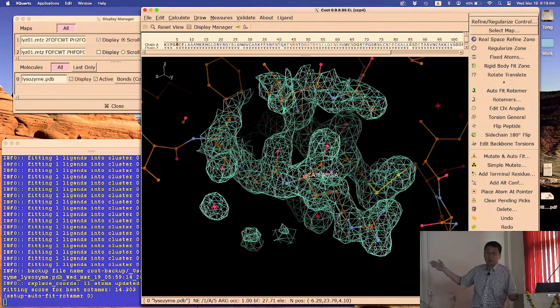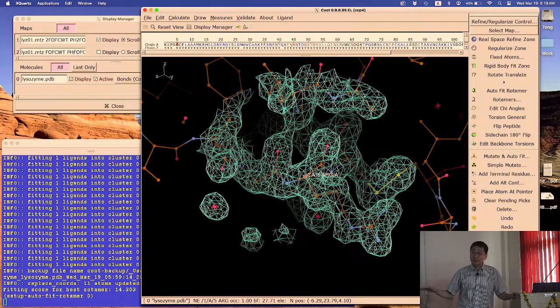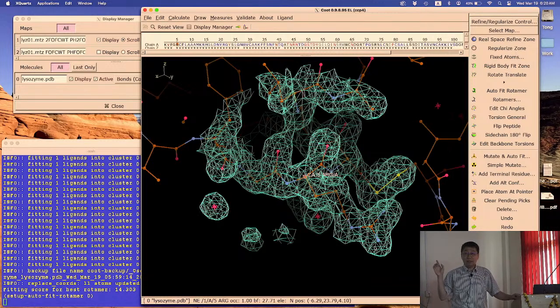As I said, it's a steep learning curve, but I'm happy to see that we are now on the same page. So you are at least making inroads into this program. Practice makes perfect. So now you have my primer, all that stuff, play around. I'm here for 2 more days, so if you have questions, grab me, I'm happy to help. Okay? And I think that's all I'm going to say about Coot today, in the interest of time as well. But would you like to see a beautiful picture? Yeah. All right, let's do that.